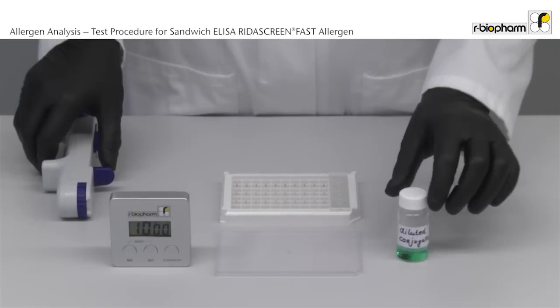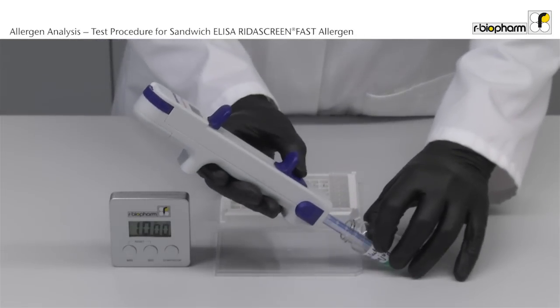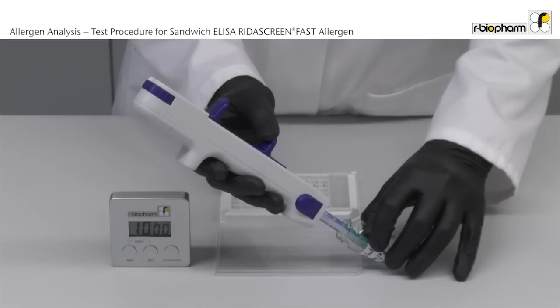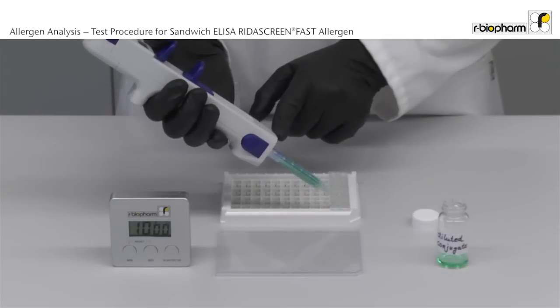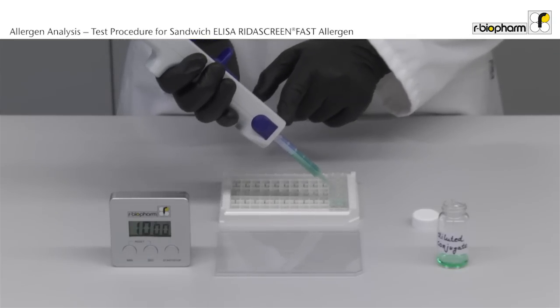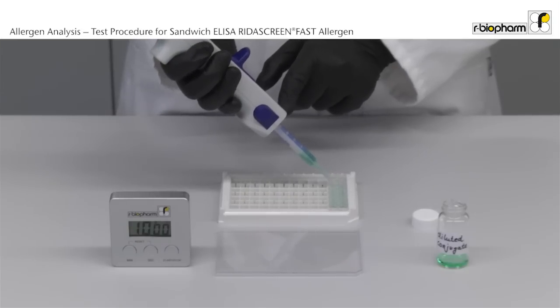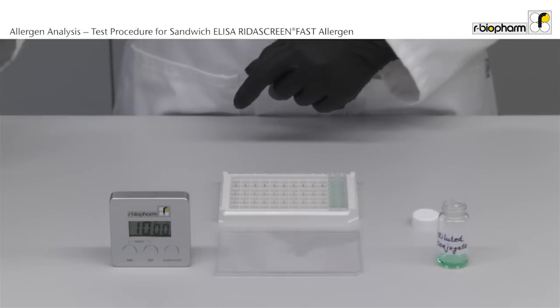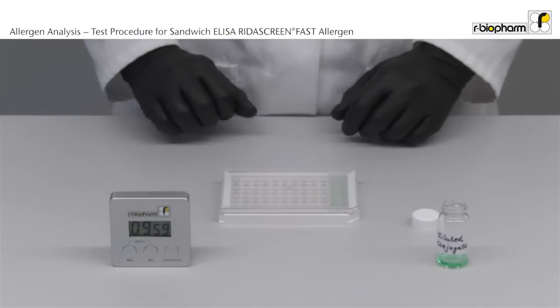Pipet 100 µL diluted conjugate using a stepper. Make sure the volume settings and the pipet tip are correct. Flush the pipet tip several times and avoid bubbles. Discard the first aliquot before pipetting the ELISA. Avoid splashing. Put a lid on the plate. Incubate for 10 minutes at room temperature.